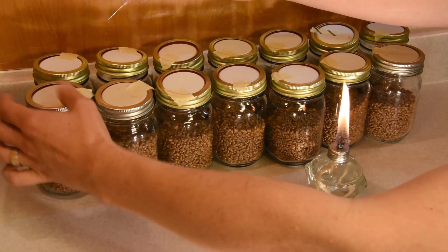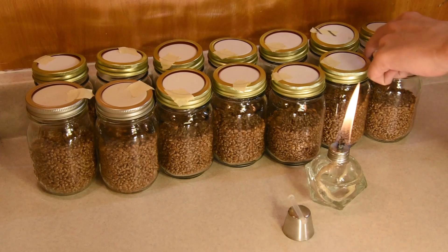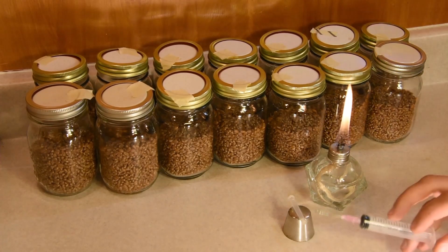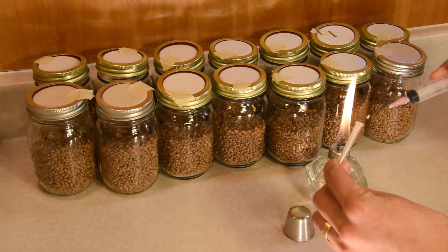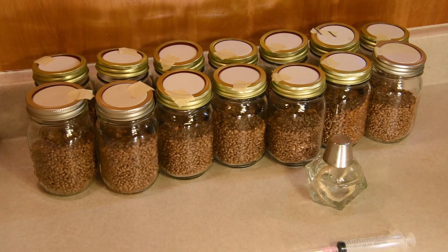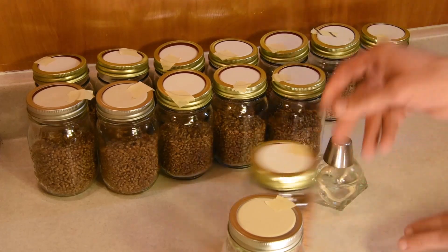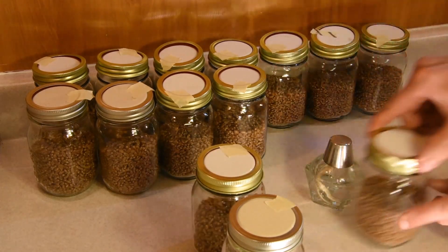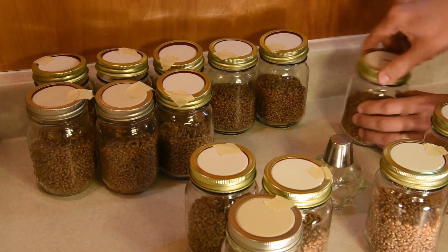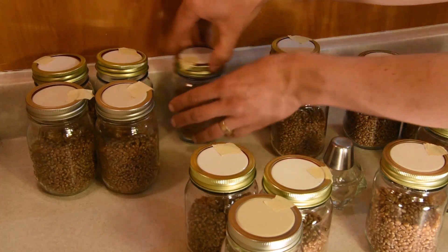It looks like I'm going to have a little bit left over, so I'll top off the first couple of them since I was being a little more conservative at the beginning. I'll finish off the syringe and now it's empty. I'll put the lid on just for safety, turn the flame off, and now I want to seal the jars as quickly as I can so they don't get contaminated. I'm just snugging them down — not super tight — but it will allow air to exchange below the lid.